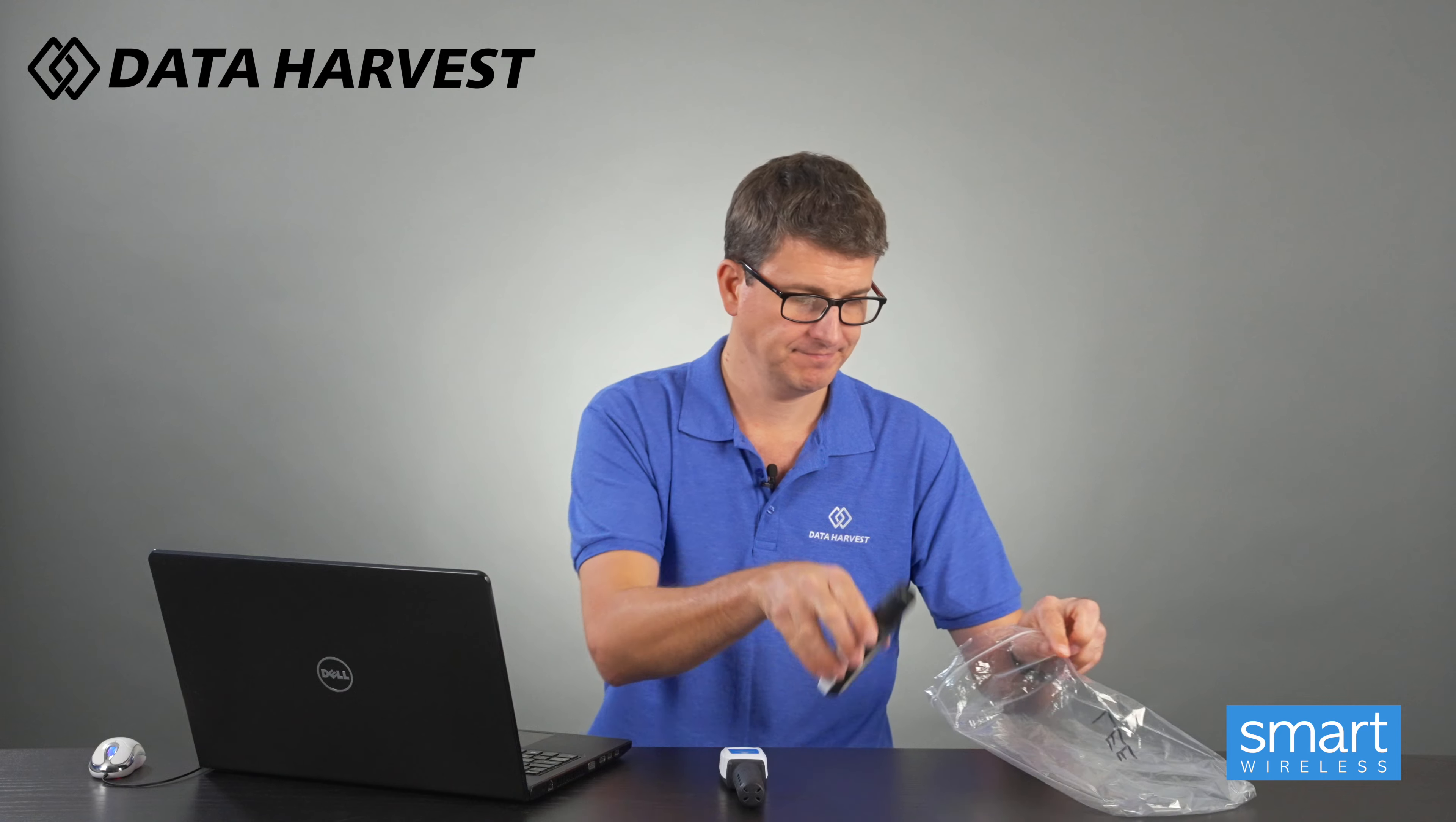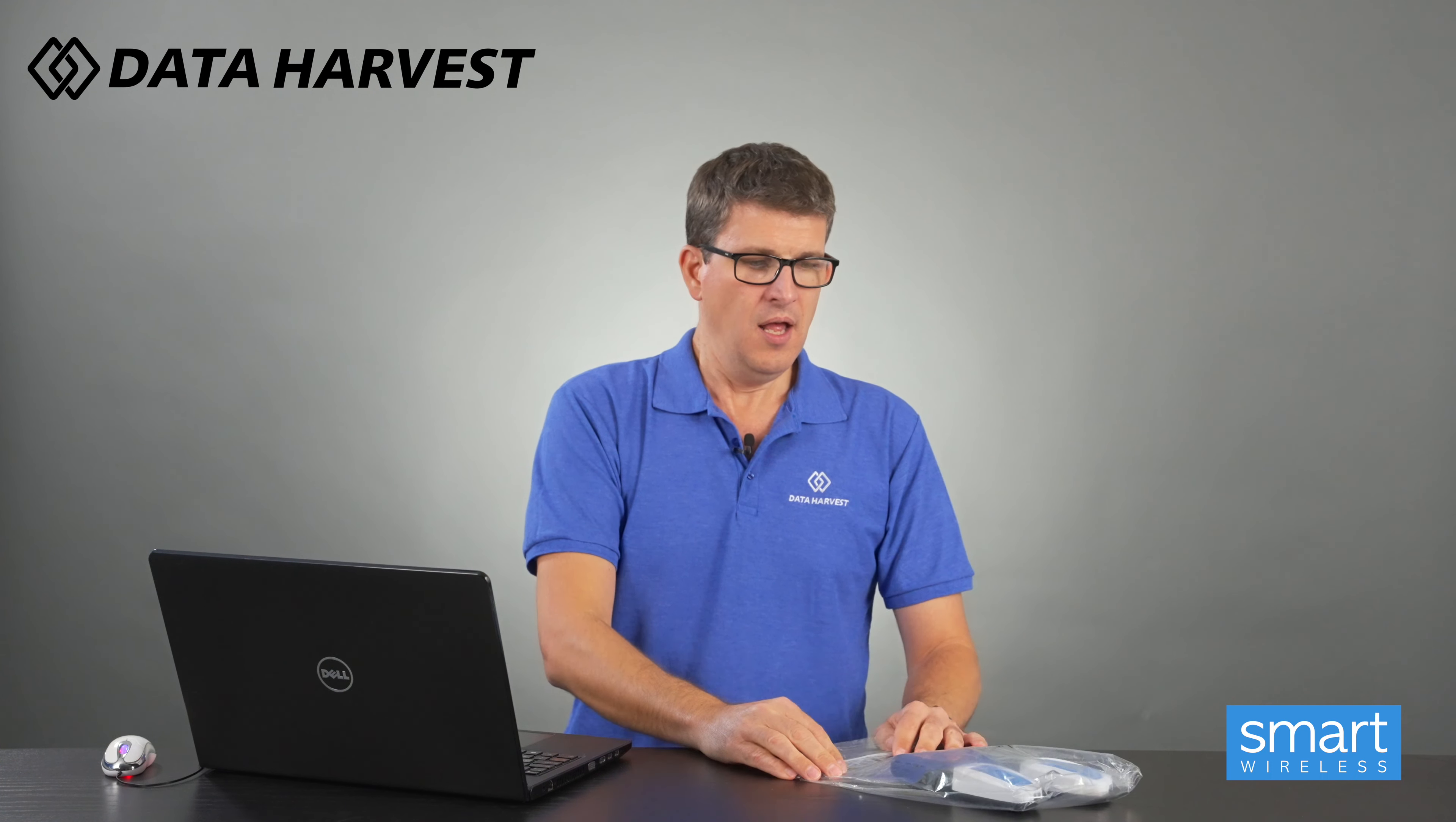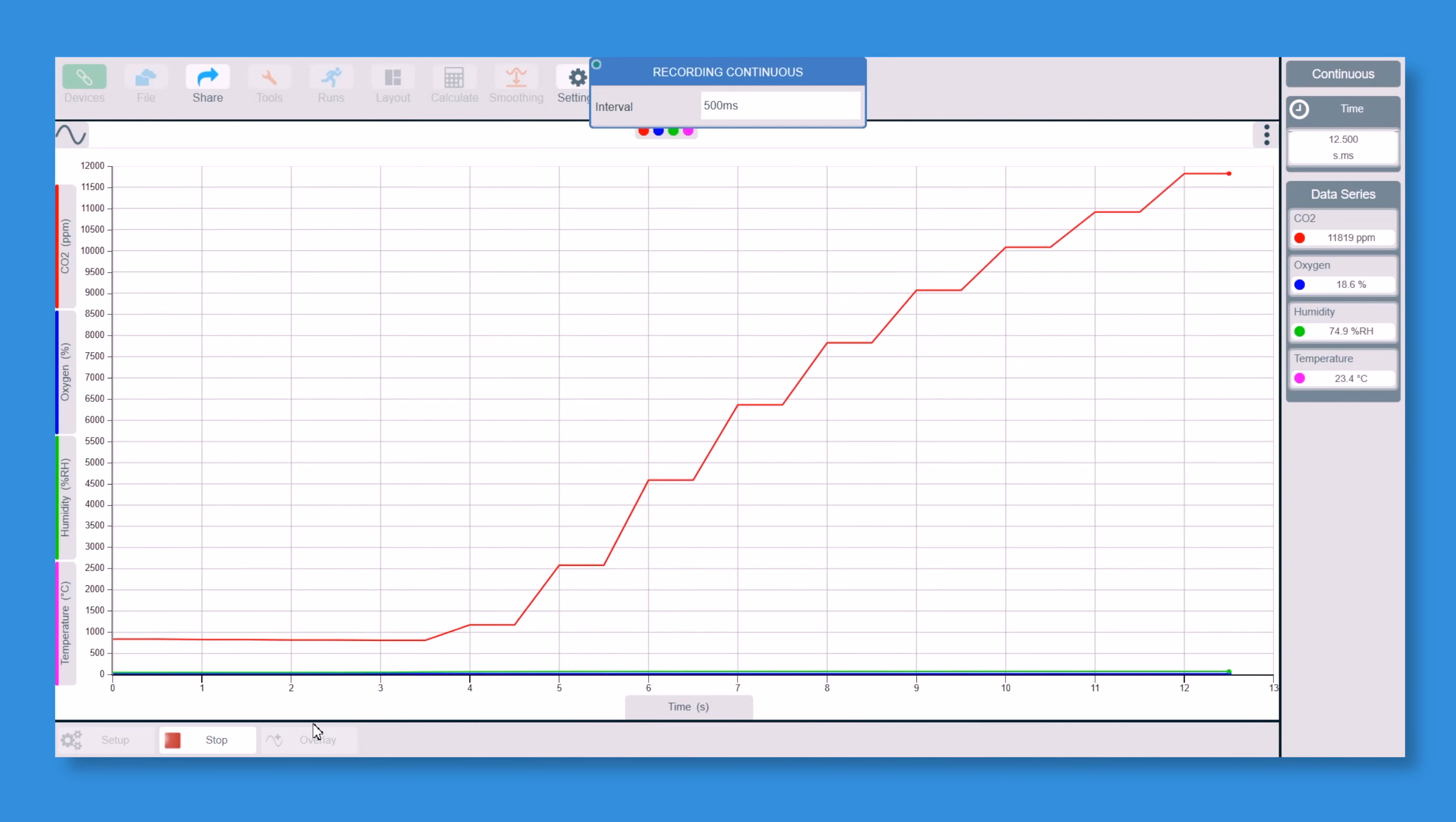So put the sensors both in the bag, pour out as much air as we can, click on start. So deep breath inside and then seal it. You'll see the red line on there is the CO2 sensor absolutely shooting up, which is brilliant.